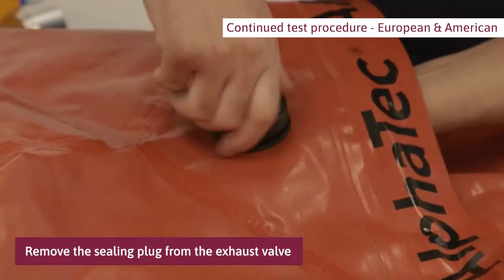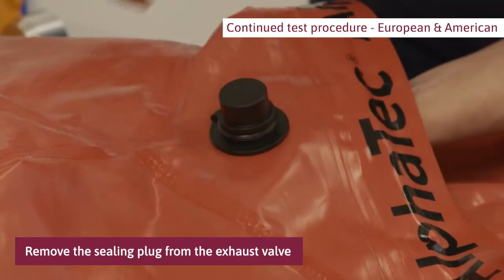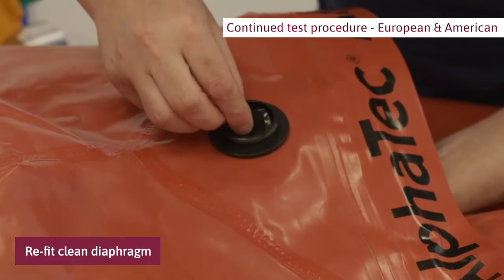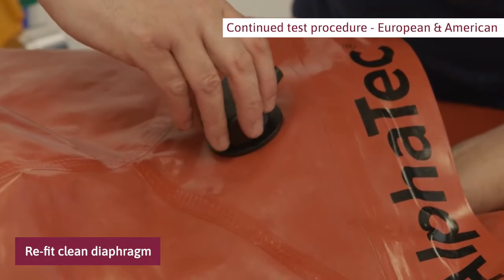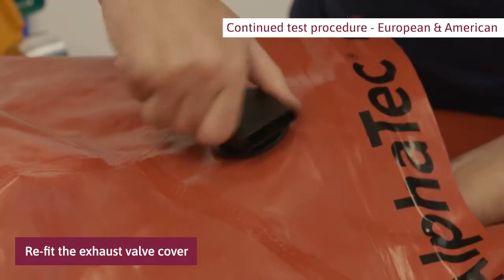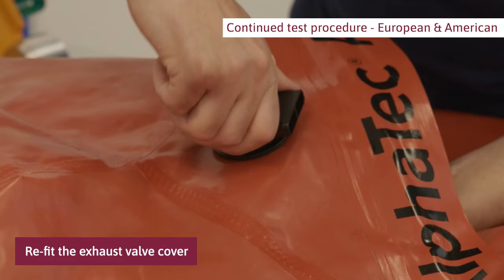Remove the sealing plug from the exhaust valve. Ensure that the removed diaphragm is clean and free from dust. To refit, push the diaphragm center over the retaining pin in the valve body. Refit the exhaust valve cover taking care not to cross thread. Screw the valve cover clockwise onto the valve body, turning the cover until there have been three clicks on the cover lug and valve body stop.